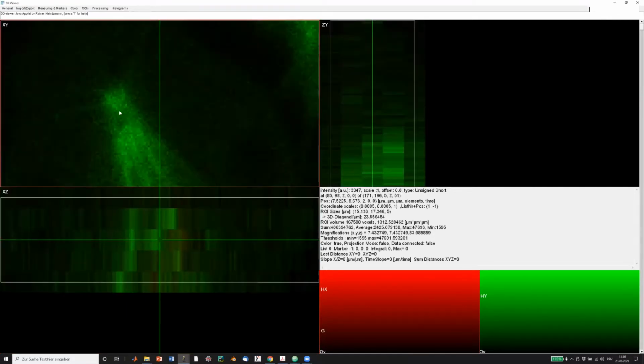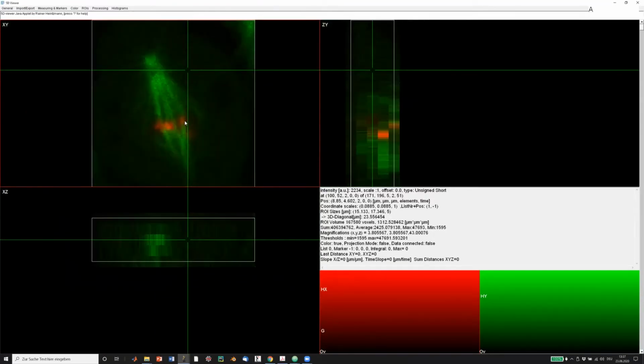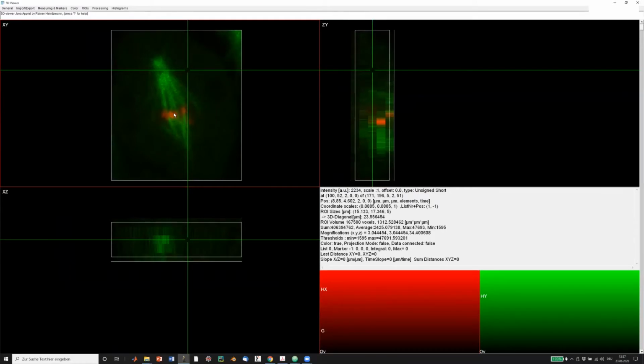You see that it actually was filling out the X coordinate, but in this case, not the Y coordinate. And what I then did is I pressed the letter A to zoom out.